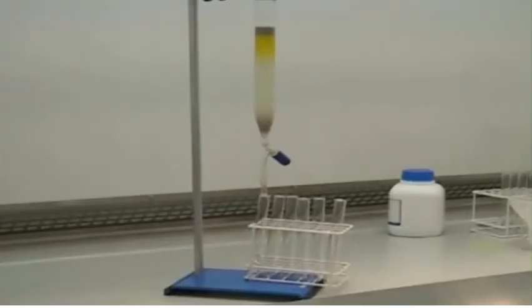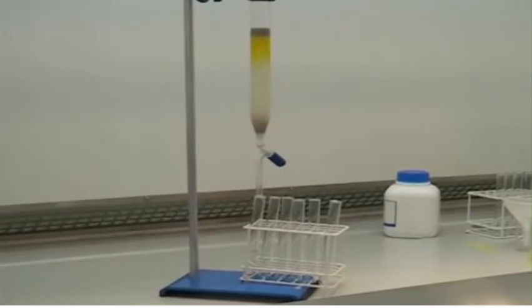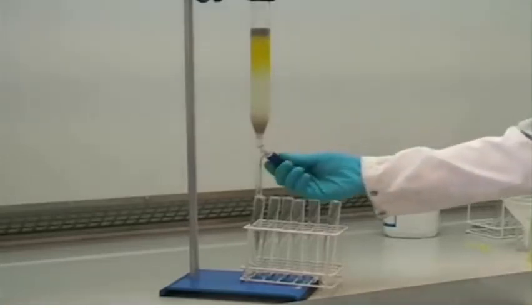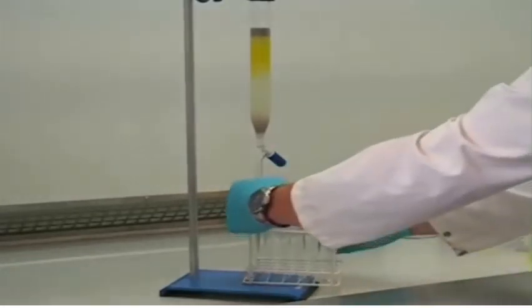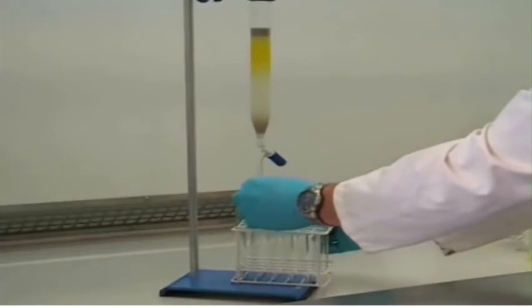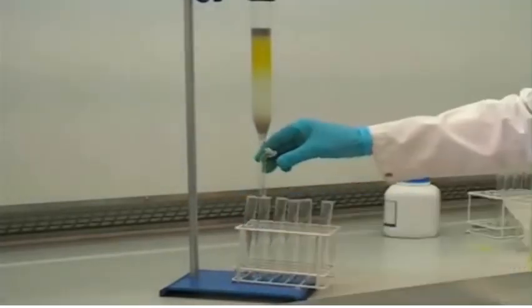So we open the tap at the bottom of the column, and this allows us to collect our first fraction. In this case we're collecting the fractions in test tubes, but depending on the size of your column you may use sample vials or even conical flasks. Once collection is complete, we can close the tap momentarily to move on to collect fraction number 2. And this process can be repeated any number of times to collect as many fractions as are required.